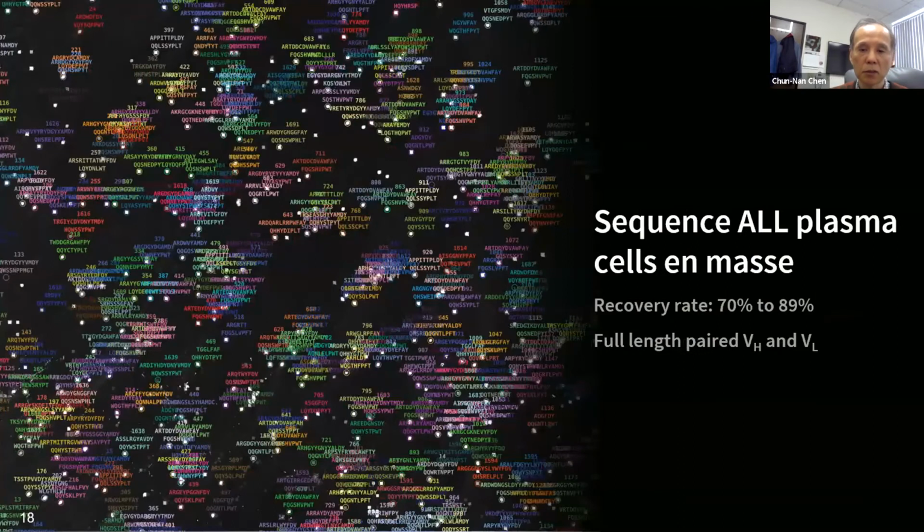So this is when you sequence all of these cells, and this is again a representation of what it might look like. We sequence all of the cells here, and what I'm representing here is the heavy chain CDR3 on the top, and then the light chain CDR3s at the bottom, to imply that we actually got the sequence of this particular spot.